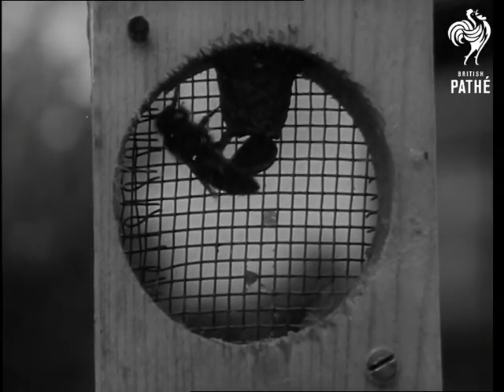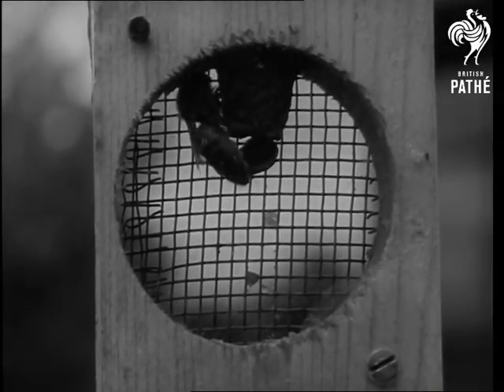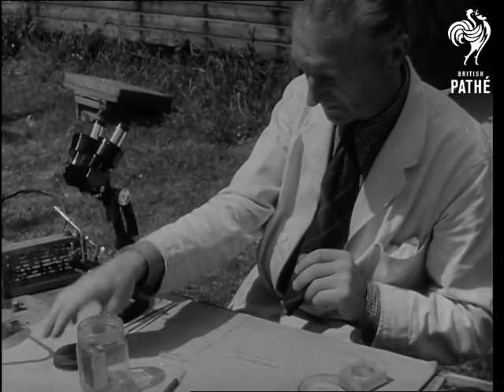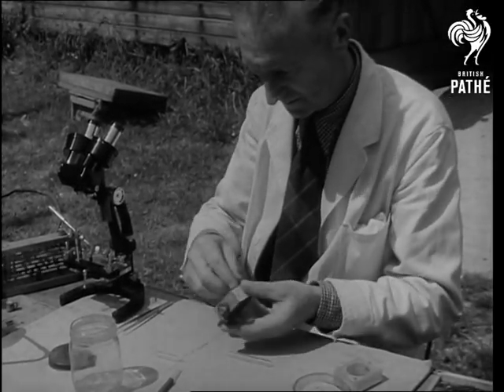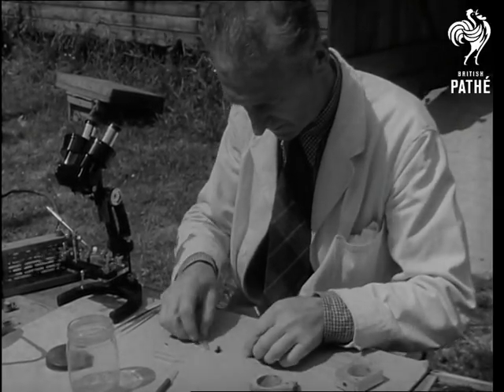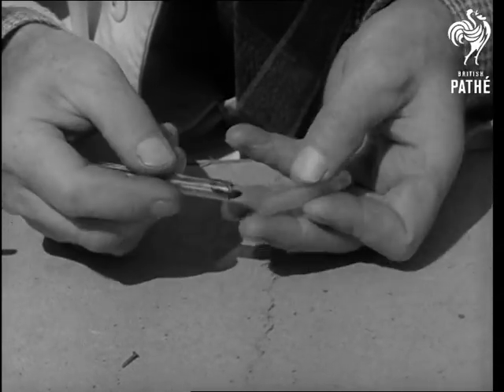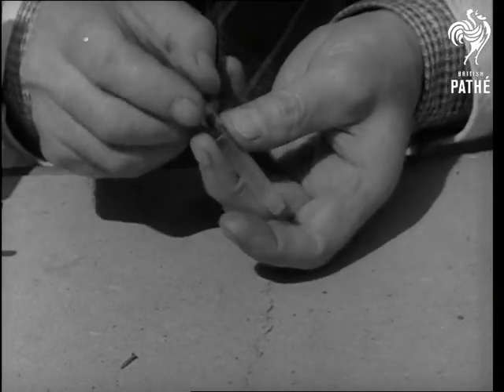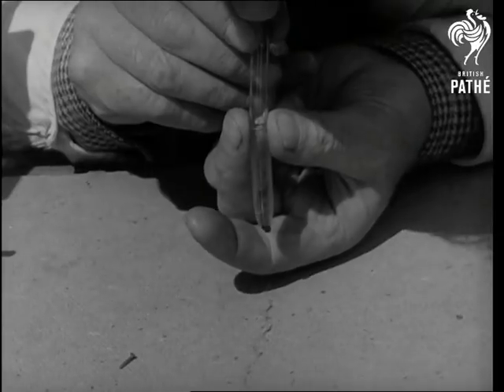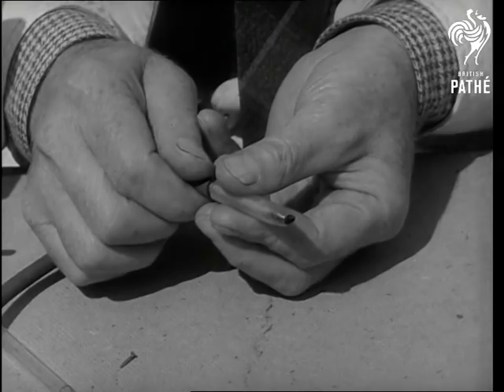And now, the queen makes her debut. When she is three days old, the queen is anaesthetized in a jar of carbon dioxide in readiness for insemination. Then, into the holder. She has been blown down the tube so that she is half in, half out. Further carbon dioxide is fed to her through the rubber tubing. Now, over to the microscope.